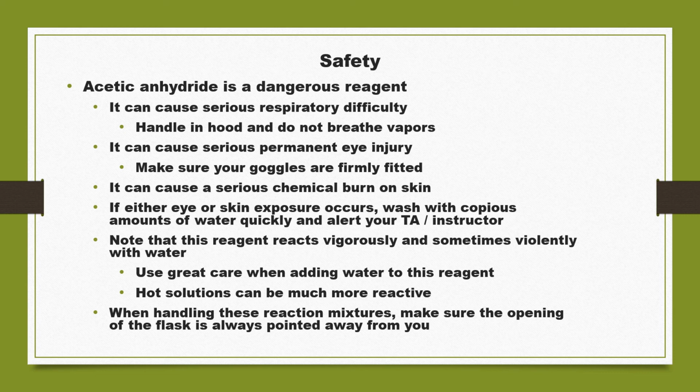However, because in this experiment we involve heating for our reactions, there is high probability that these chemicals can undergo violent reaction, they can be more reactive, and we have to be careful for that reason.